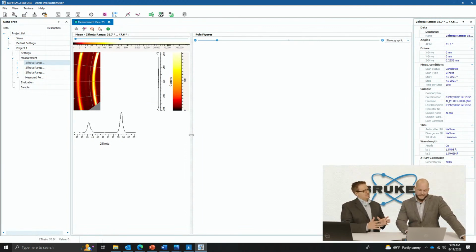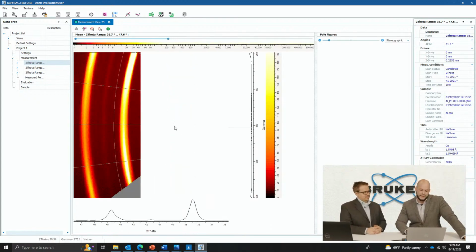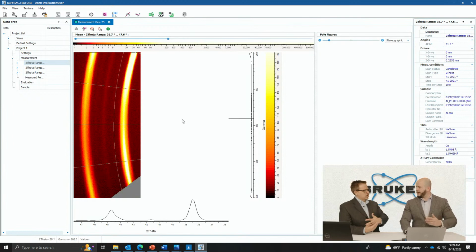And how many images were there about here? Hundreds. 100, wow. Yeah. Okay. So, and that was pretty quick, and you're just using a laptop. That's right, yeah. So you can see the algorithms have been kind of streamlined, and with computational power these days, it's a lot easier to do this type of stuff. All right. For a standard user. So you can see kind of how good the Eiger is in capturing multiple reflections in our sample. So now, again, this was coming from one of our measurement schemes, and we're able to collect more information because of the detector coverage. So now, the Eiger then, that's this 0D, 1D, 2D detector. Right. And then here we're using it in a 2D mode. Correct. So it makes a picture.